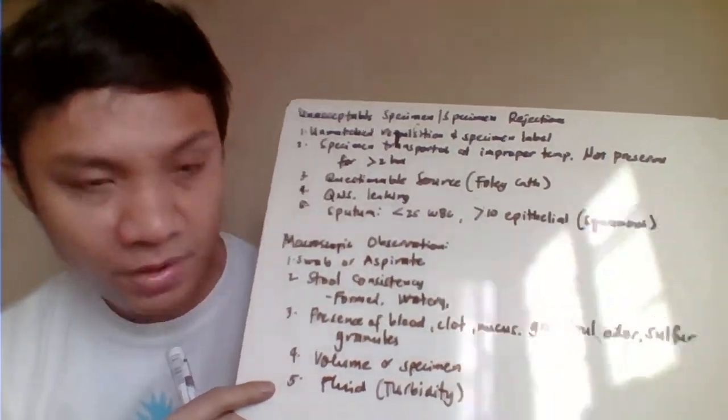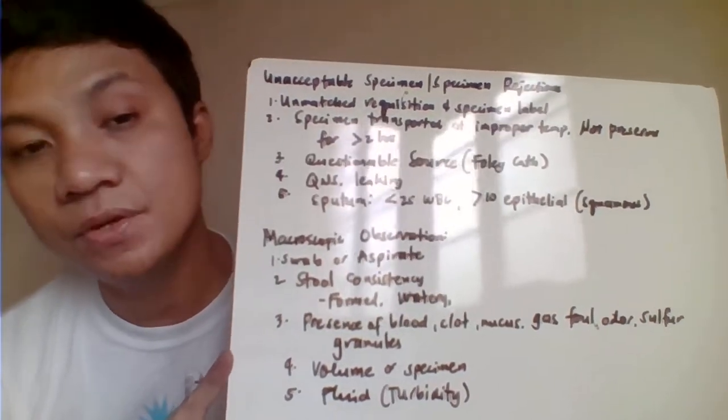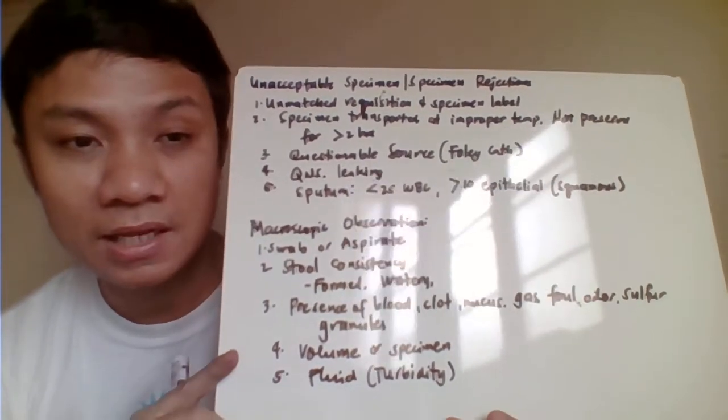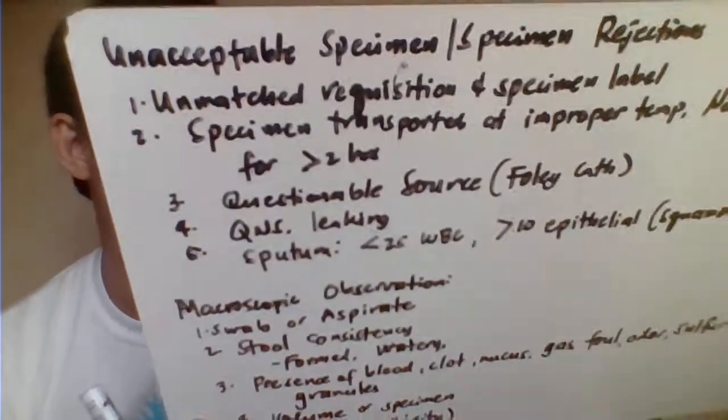And number 5, we have here for the fluid, like mga body fluids natin, you should indicate also, is that clear, is that cloudy, is that turbid. Again, it will help here in the proper interpretation of your results.